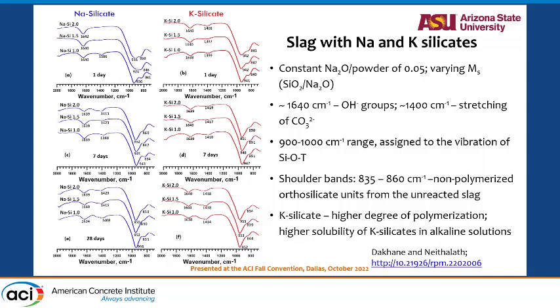Do I have Si-O-Al from Si-O-Si? So we can do some of those quantifications that happen with time. I've listed here some of the bands that you typically see when slag is activated by sodium or potassium silicates. The cationic effects on activation are also significant, and we pick that up from FTIR.